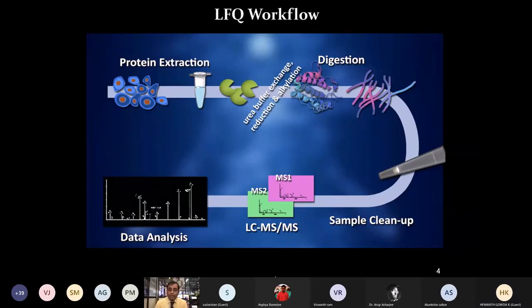And being a live run, you can see that not every run comes out so great, and this run did not start the chromatogram so smoothly, as one would expect, going slowly and then reaching the higher intensities. But nevertheless, the run is still going on.